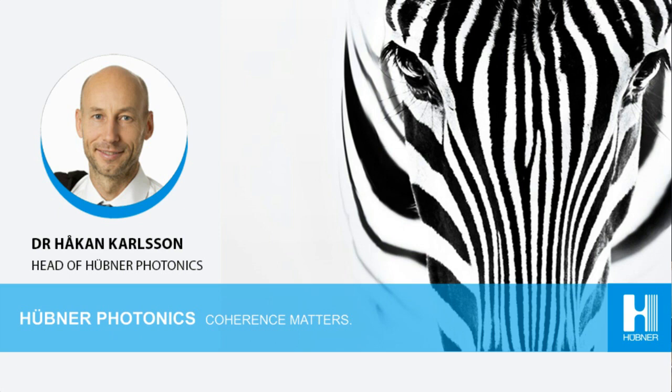Next question: do the lasers need isolators? Then I guess that we're talking about optical isolators here. Yes, I briefly mentioned that on the slide about the different laser technologies. I mentioned that the diode-based lasers, the frequency locked diode lasers, might be more sensitive to optical feedback than the diode pumped ones, which is at least partially true.